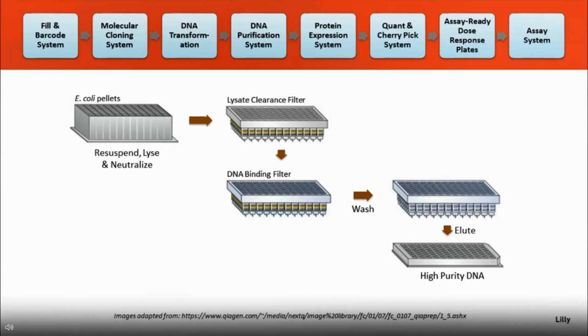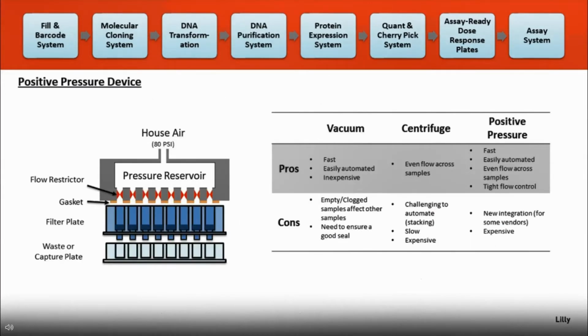And so in talking with Beckman, we had explored some other options with how to proceed with handling filter plate-based purifications. We had the idea to explore positive pressure devices. So we had this discussion with Beckman. They talked about some positive pressure devices, and then we started looking into it more and found several options on the market. And so we brought a few different devices in that I'll talk about on the next slide.